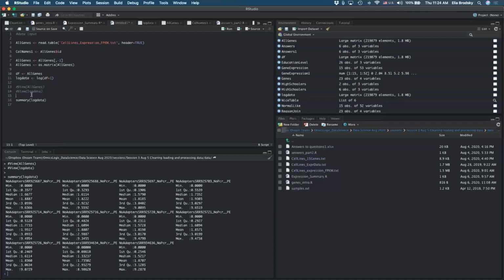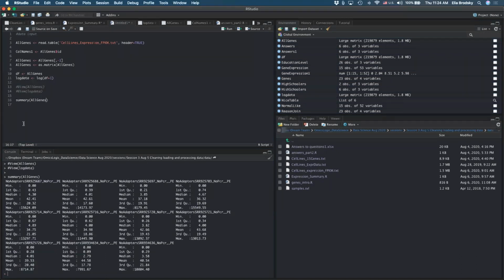Right? So let's do the same, but let's do summary for, I guess, the raw data, all genes. Okay, what are my maximums? They're very different, right? Look at this, 15,000, 14,000, 8,000, 15,000, 13,000, right? 11,000, 7,000, 8,000.